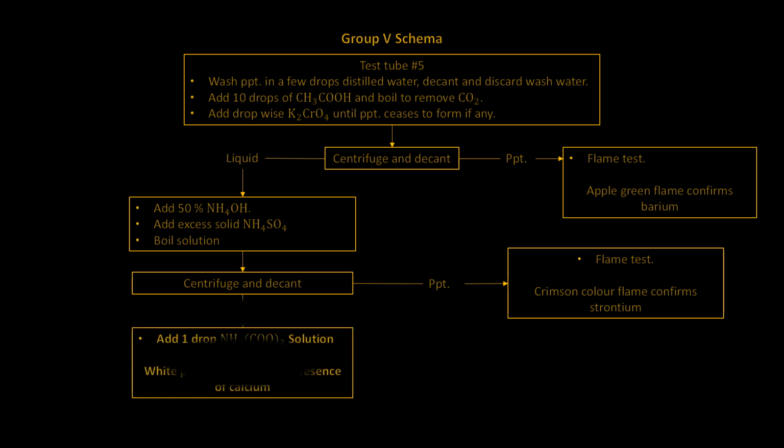To the filtrate, add 1 drop of ammonium oxalate solution. If a white precipitate forms, it confirms the presence of calcium.